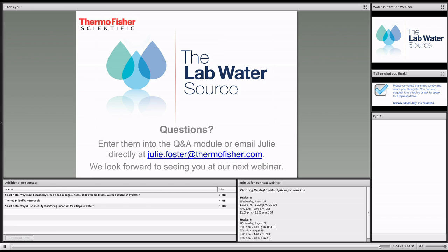From the tank, you can feed the different pieces of equipment in your lab and feed the Type 1 system. And then the Type 1 system would produce ultra-pure water for you. So if you need a lot of water, that's always a good configuration because it tends to be more cost-effective than one system. But there's a lot of nuance there.